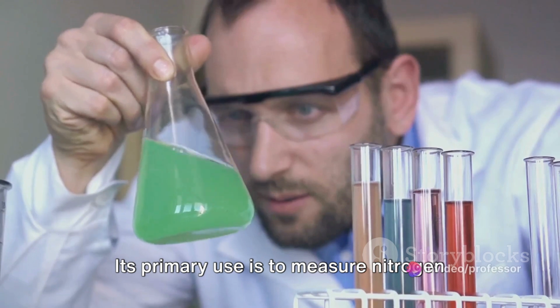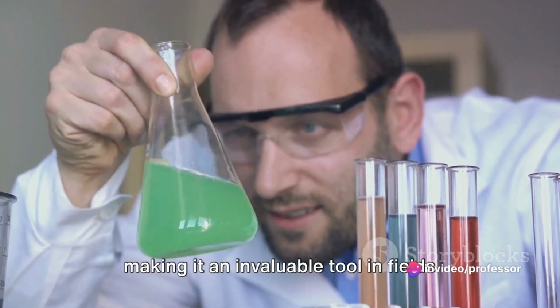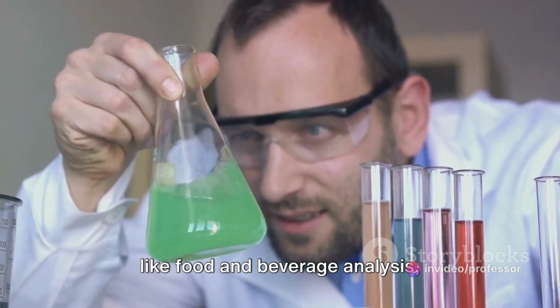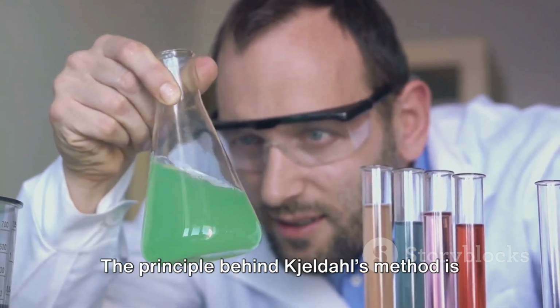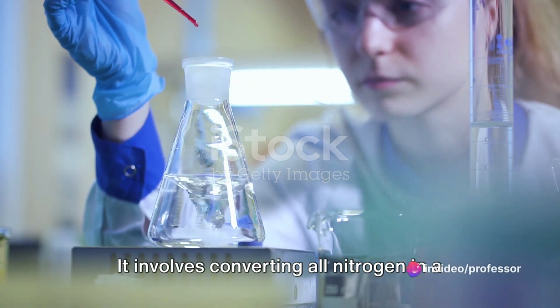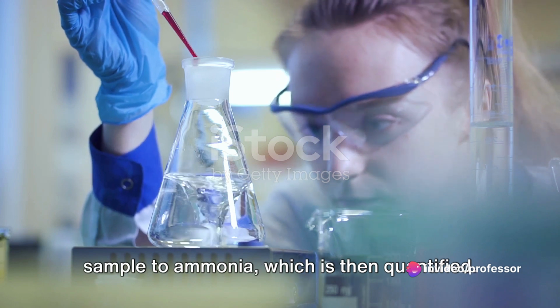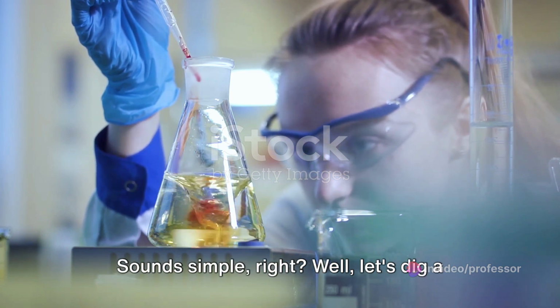Its primary use is to measure nitrogen content in organic and inorganic samples, making it an invaluable tool in fields like food and beverage analysis, environmental testing, and pharmaceuticals. The principle behind Kjeldahl's method is quite straightforward. It involves converting all nitrogen in a sample to ammonia, which is then quantified. Sounds simple, right? Well, let's dig a little deeper.